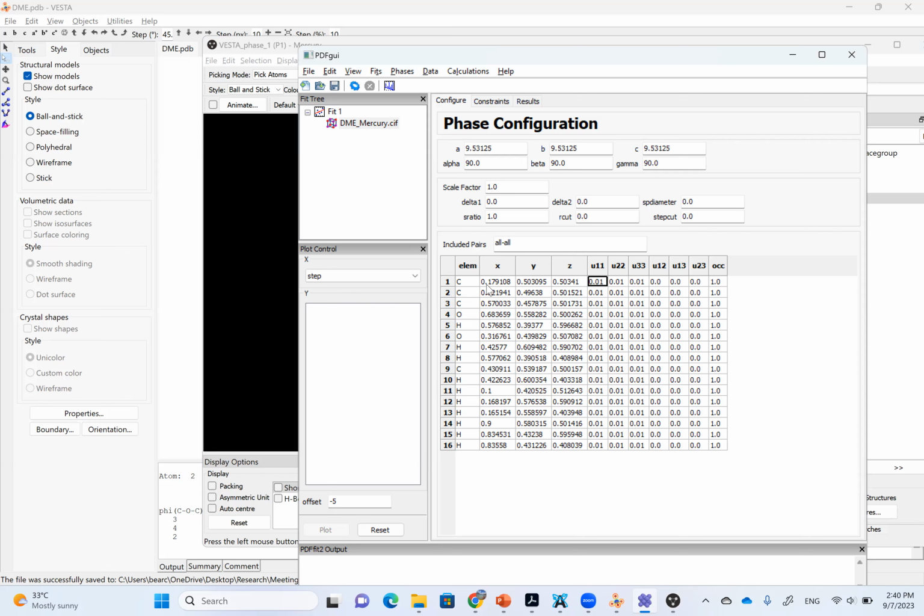Okay. And we can have a quick check. The number of atoms should make sense. We have actually 4 carbons, right? We have 2 methyl on the end, so that's 2 carbons. 1 ethyl in the center, that's another 2, so it adds up to 4. So we do have 4 carbons here. So this is 3, there's another one here. So those are the 4 carbons, and we do have 2 oxygens. Right? And also we can verify the number of hydrogens makes sense.